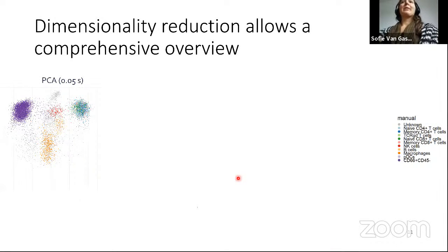Very shortly, a little bit more detail about dimensionality reduction. I think the best known dimensionality reduction method in general, not flow specific, but just in the computer science field at all, would be PCA, principal component analysis, where you're actually looking for the direction that explains most variation in your data set. You could also apply this on flow data. I have an example figure here. But as you might notice, in this cloud over here, there's actually a lot of colors mixed up. So while there are some big variances between some cells, some others differ in only a few markers.